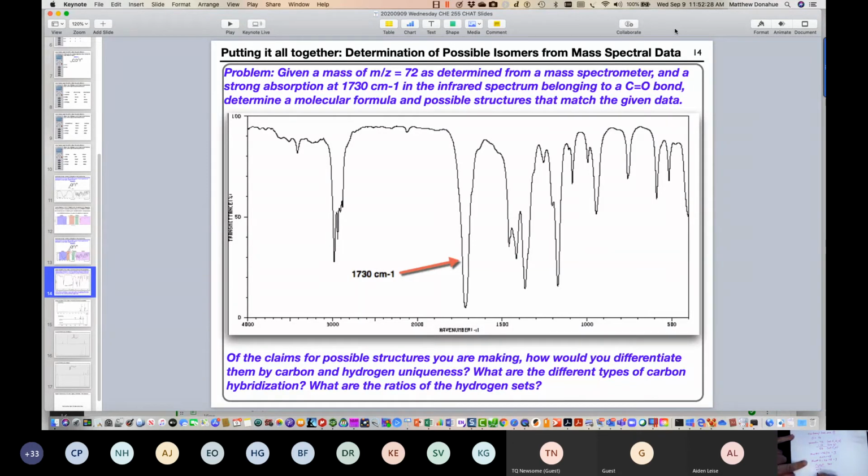So yeah, if we have N equals 4, and we do CnH2n+2, C4H10, this is fully saturated. Our molecular formula, oxygen, again, doesn't contribute. So we come up with 1, but look back up here, remember from the IR? The IR is telling you that there's a carbonyl group, right? So how many degrees of unsaturation does a carbonyl group have? This has 1 degree of unsaturation. And that's what we just calculated, right? So that 1 degree of unsaturation is the carbonyl group.